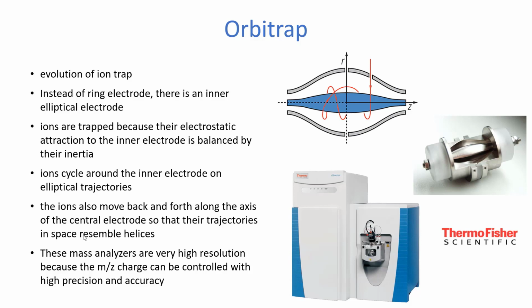The company that has really cornered the market on the Orbitrap is Thermo Fisher Scientific, but I don't think you can get an Orbi from anyone else. So the Q Exactive is the standard model that everyone looks for in an Orbitrap, and there are varying degrees of how powerful these ones can be, but a lot of people in proteomics like these Q Exactives.